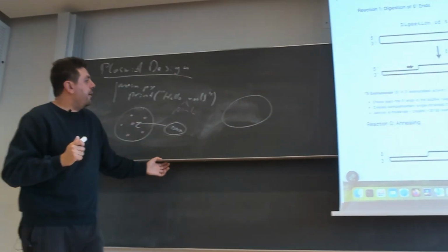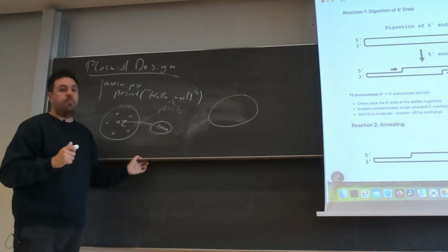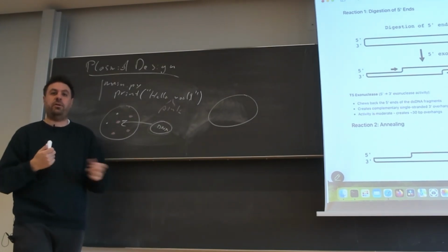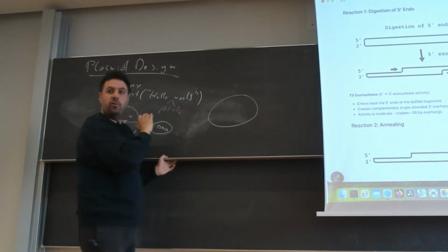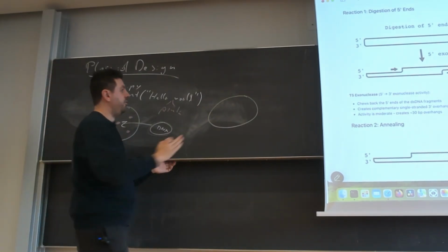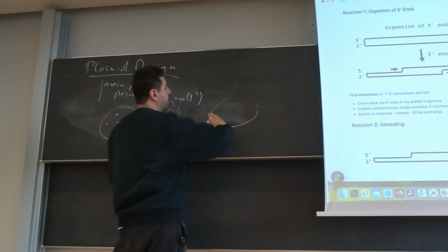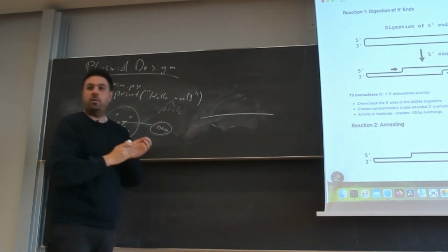And this plasmid is typically called a backbone or a vector because it's meant to carry an insert afterwards. So what we will actually do is linearize this. You will do one method to linearize this in the lecture, and you will do another method in the problem session. Linearizing means just creating a linear version out of this.